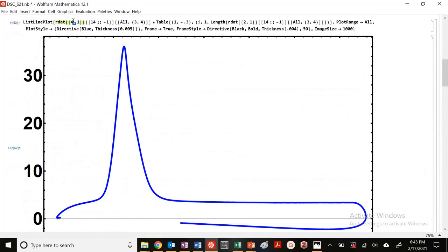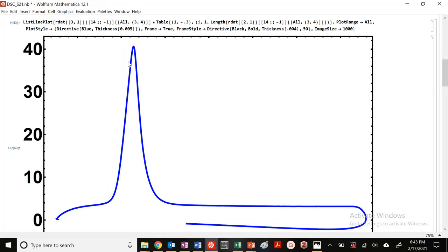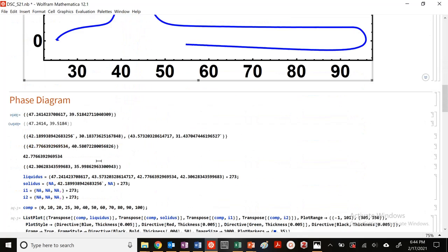Let's go back to this diagram here on number 3. But again, it's kind of your choice. So you could see there's a little bit of asymmetry here, but we'd have to zoom in on this graph to see what's going on here. So there might be a little peak here. There might be a little higher peak, right here. There's a little bit of a hump going on. So you could pick, for example, right here, maybe something like right here. So those could be the temperatures as well. So let's go ahead. You could plug those in previously and compare those values.